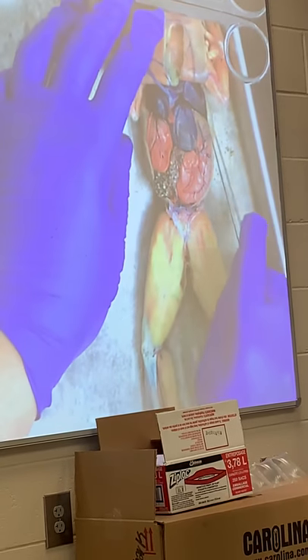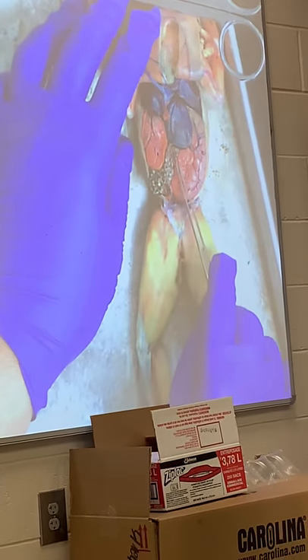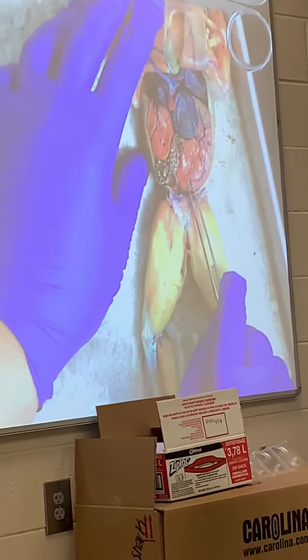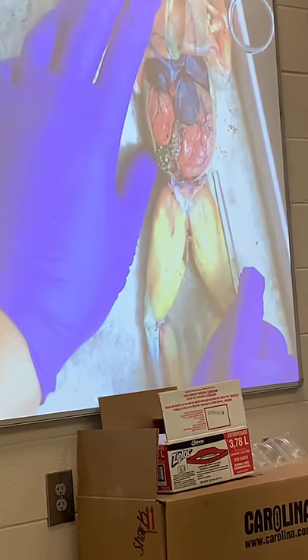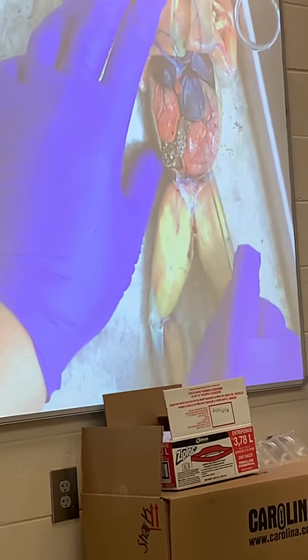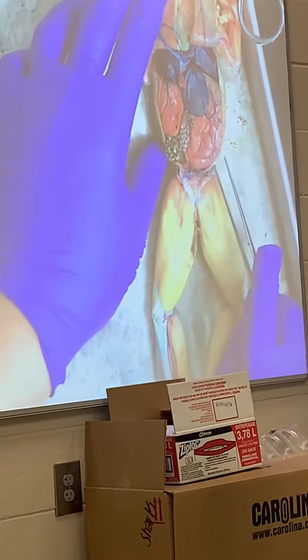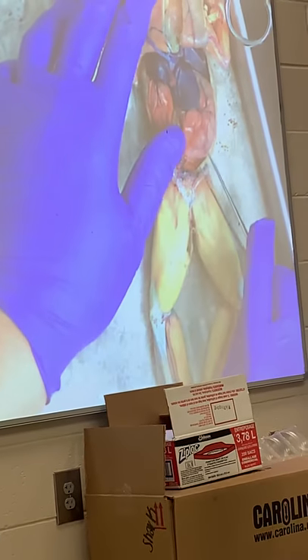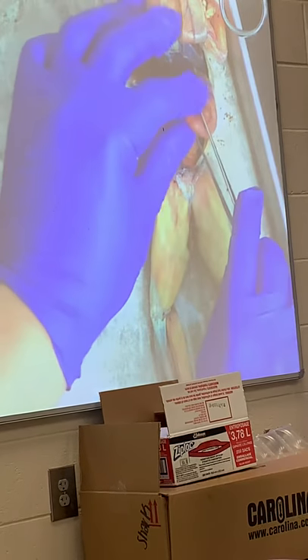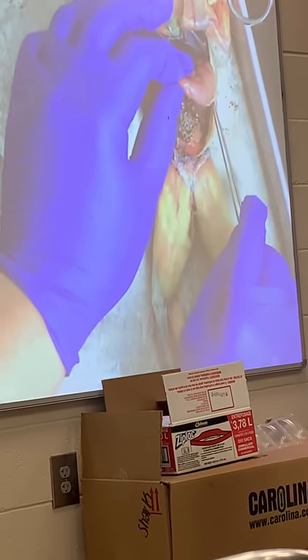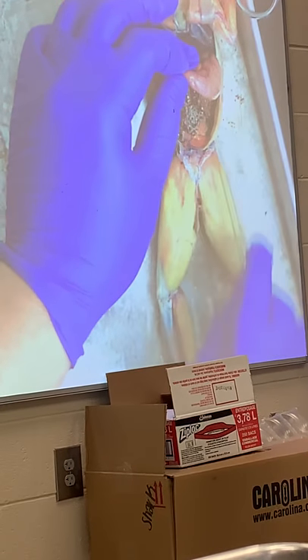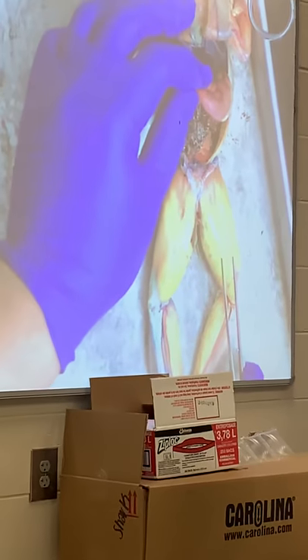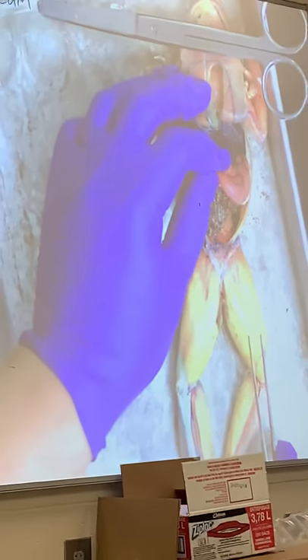Other big things that are recognized here: this big structure that forms a J shape is the stomach. Just like our shark, it has a greater curvature and a lesser curvature. And if you kind of lift up on the stomach, you'll notice that it doesn't have a big mesentery hanging from the greater curvature of the stomach, and also we don't see a spleen like we did in the shark.